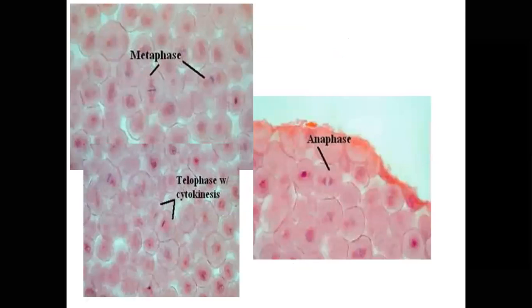And in Form 3, I don't know how many made this kind of slides where you observe the growing region of an onion. You observe onion cells that are actively dividing, which can help us to even understand the stages that we talk about, the metaphase. And you can see details here where during metaphase, the chromosomes align themselves along the equatorial plane of the cell. With the theory, you can easily identify the cells that are dividing.